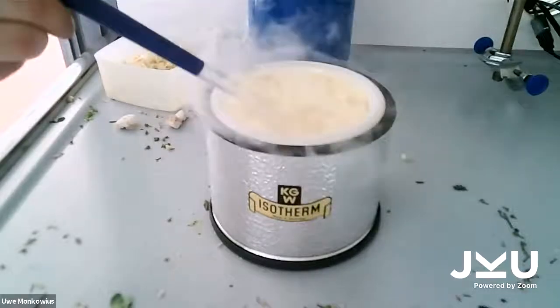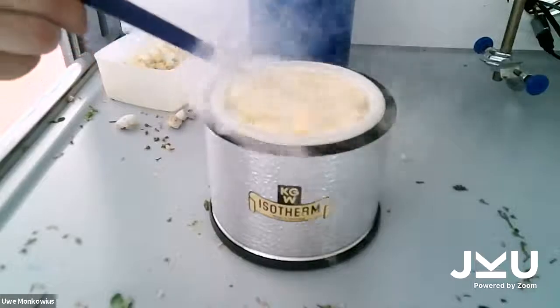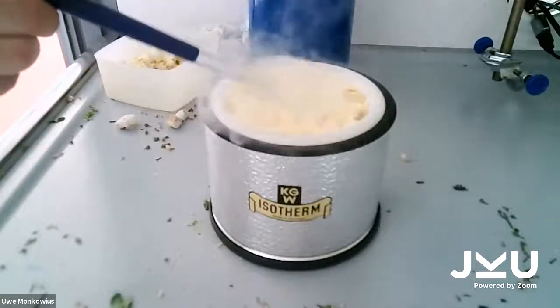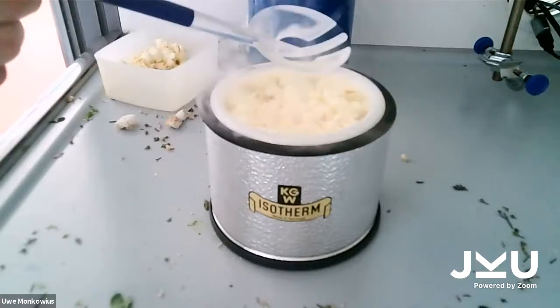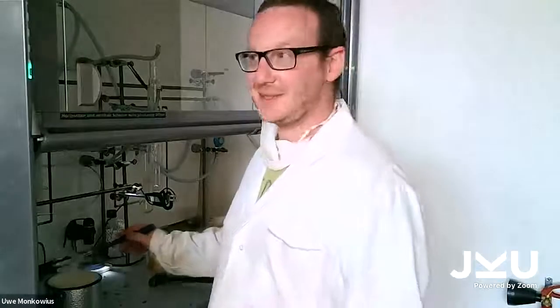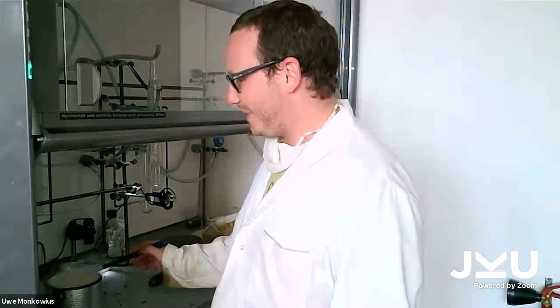So now I cool the popcorn down. And now I do something that's not allowed. I'm gonna remove my mask. Mask is removed. Otherwise the next part gets really hard. And now I'm taking out a popcorn and I put it into my mouth.